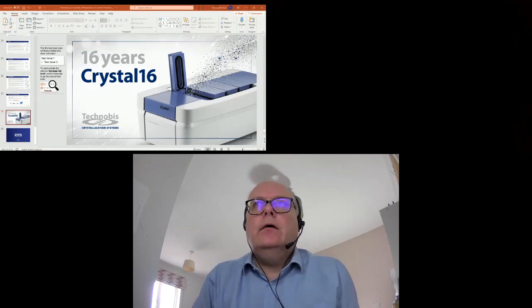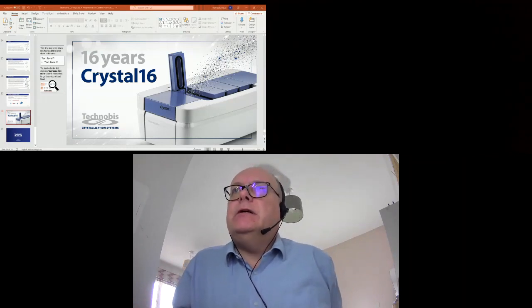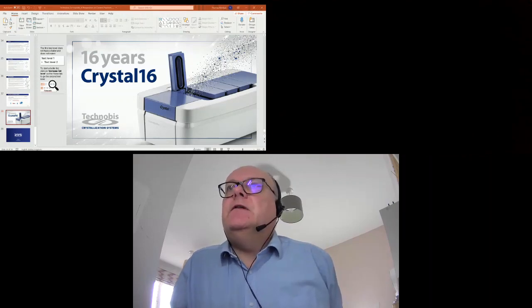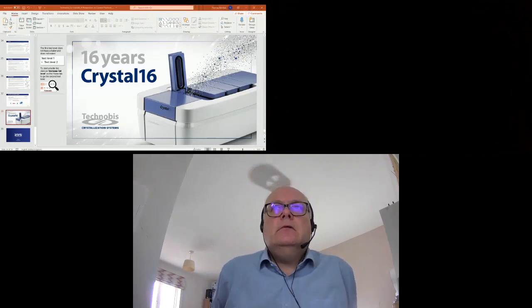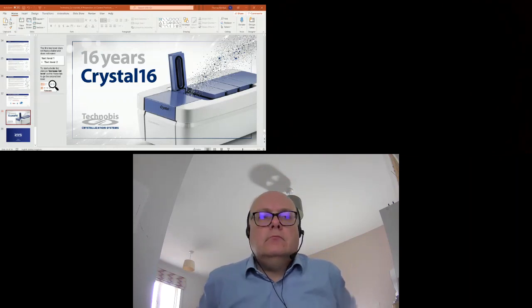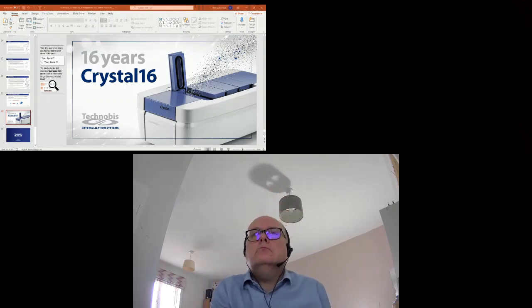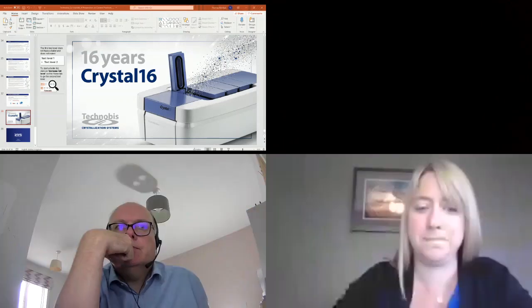Okay. We have a question that's just come into the chat. How do you avoid evaporation in Crystal 16 vials? This person's found that it can be a challenge for low boiling point solvents, especially with overhead stirring. Any comments on that? With the overhead stirring, there should be O-rings that allow you to seal it up tighter than just a regular screw cap. I would recommend going, say, 5 degrees below the boiling point of your solvent, just to avoid potential evaporation occurring, as well as maybe operating at the 1 milliliter volume.